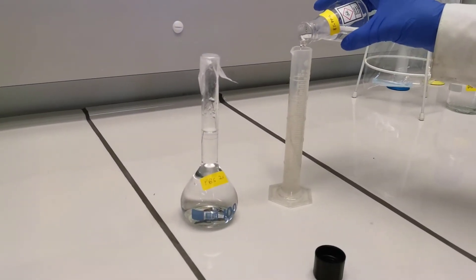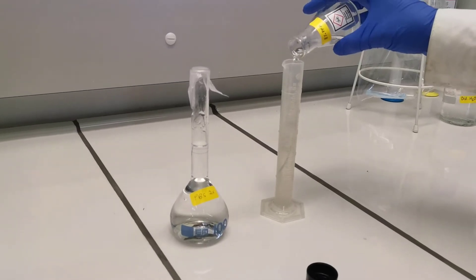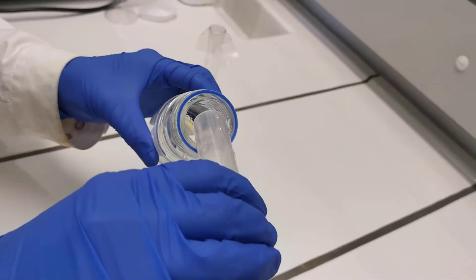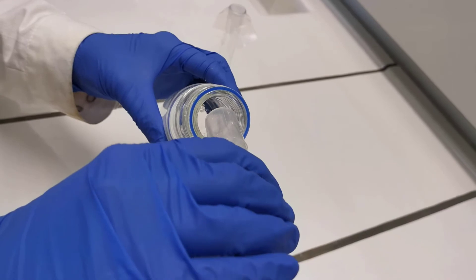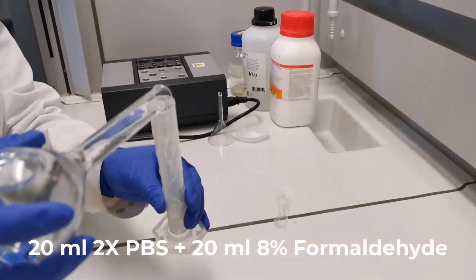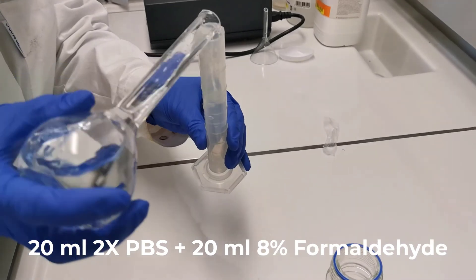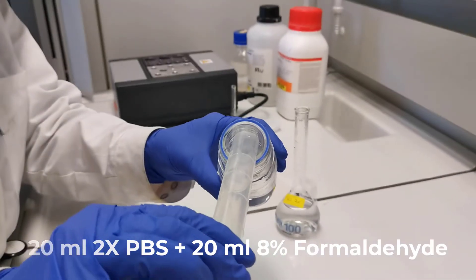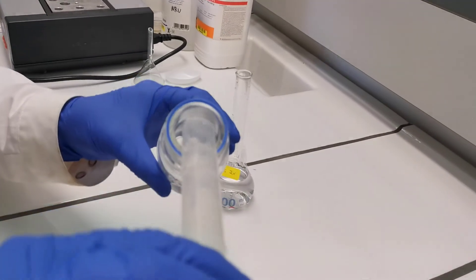Now we mix equal volume of 2x PBS and 8% formaldehyde to get a final of 4% formaldehyde. In this demonstration, we could mix 20 milliliters of each solution to get a final of 4% formaldehyde.